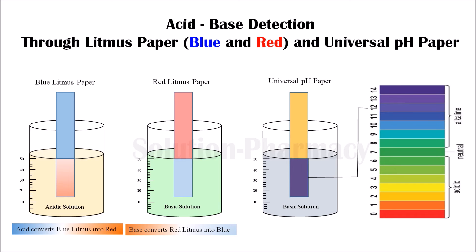If the color of the universal pH paper changes to deep yellow and matches the yellow color of value 3 on the scale, it means the solution is acidic in nature and the pH value is 3. If the color changes to light green and matches the green color of value 4 on the pH scale, it means the pH value of our solution is 4, which is again acidic in nature.